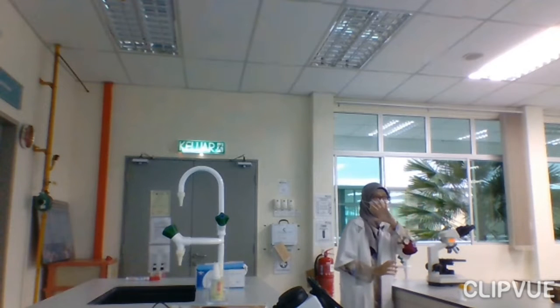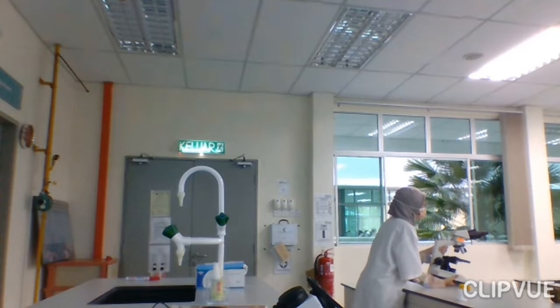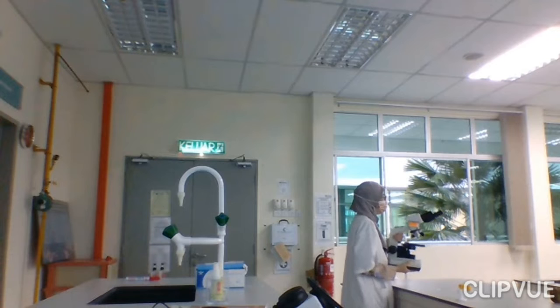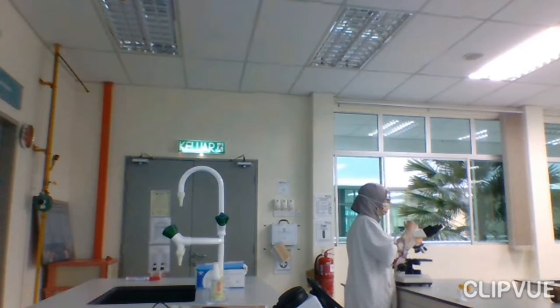With two hands, one hand grabs the arm, and the other hand you place at the base of the microscope like this. You just carry that back. Make sure that it's pointing away from you. The ocular is not pointing towards you.